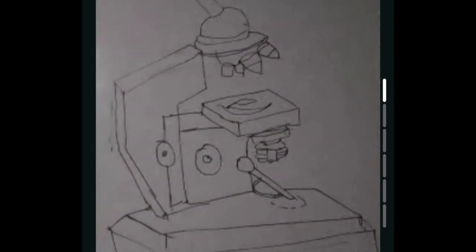Okay, everyone. A quick one. I think the microscope might be like this. So these are the essential parts. If I draw it like this for them in the exam, then surely they will give me my marks. If you guys are labeling, I think there is a question to ask. I said labeling to this part and labeling to this.